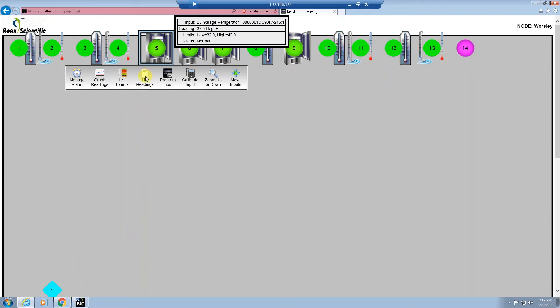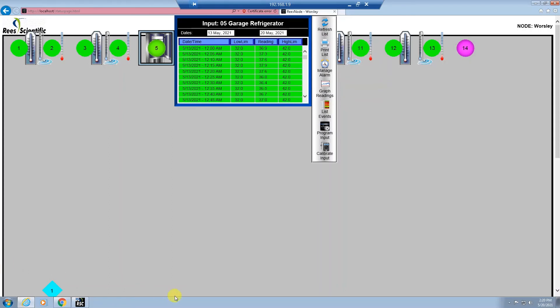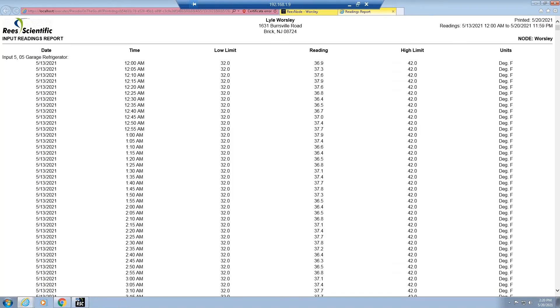The list reading report will show all recorded readings. When you select the report it will default from today's date back seven days. You can change the date range and hit refresh and you will get a new listing for your report. If you would like to print this report, hit the print list which will put this report into a new tab and you can hit print or Control+P to print your report out. Don't forget you could also save this as a PDF as well.